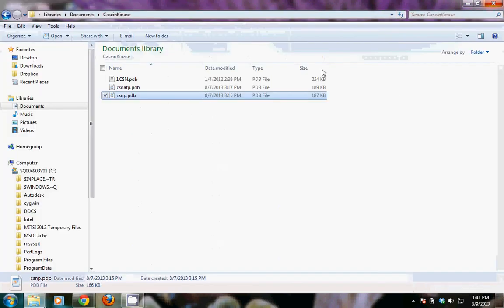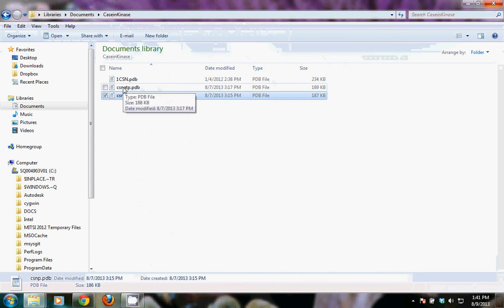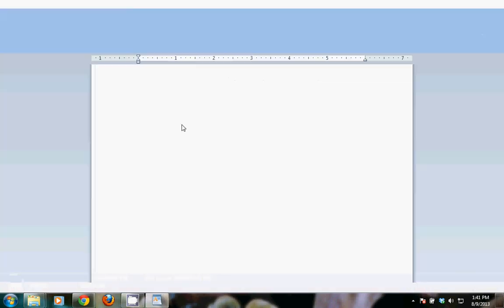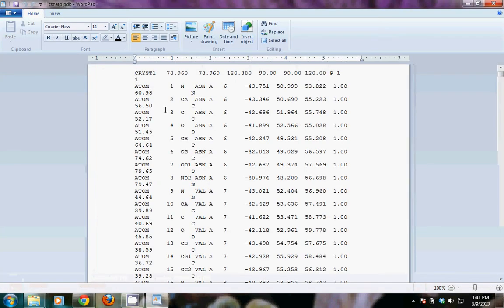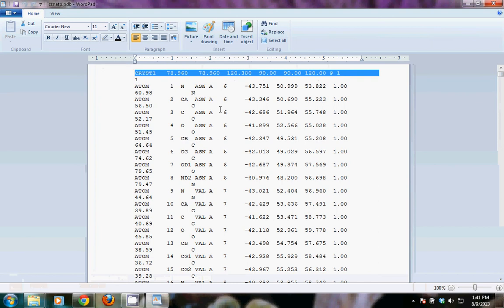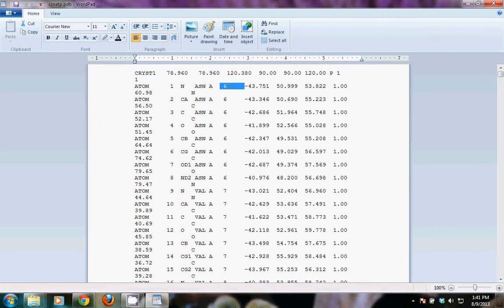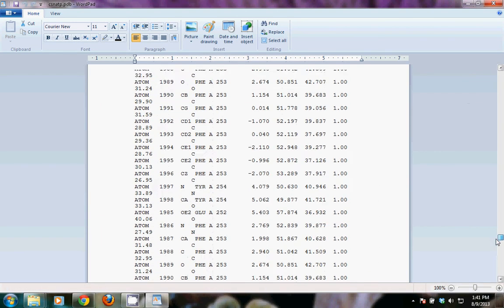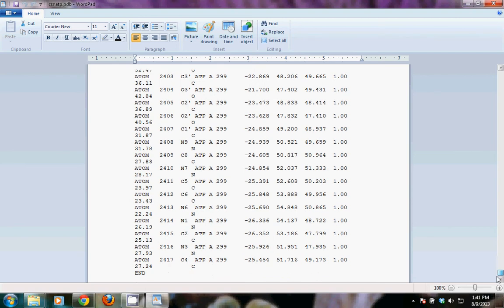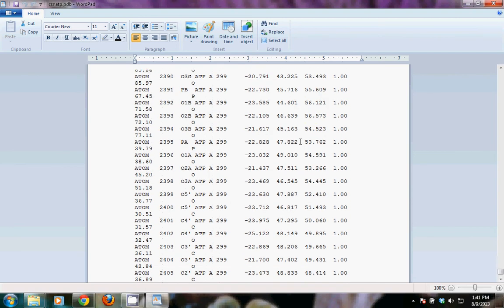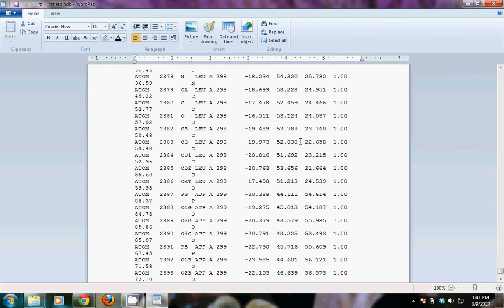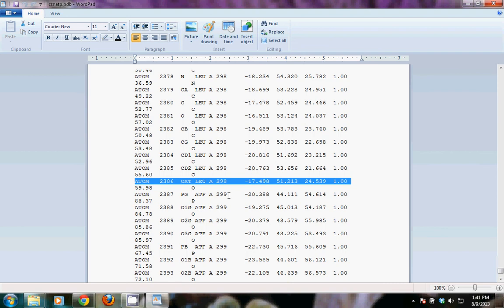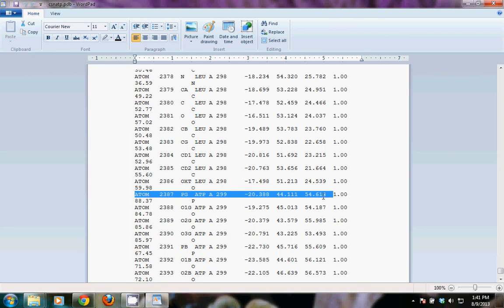Just as a comparison, we also saved one with the ATP. So open that in WordPad. It looks similar in that it starts with the crystallographic information. It starts at amino acid number 6. And if we scroll to the bottom, we can see that the protein ends with that 298 leucine. And then there's the ATP.